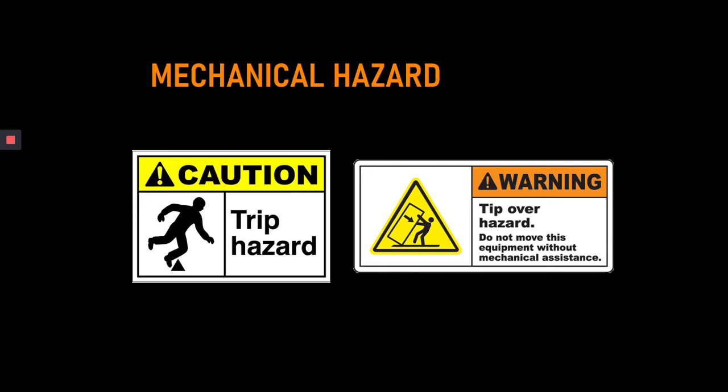Usually mechanical hazards result in accidents inside the laboratory. That's why before you manipulate a certain equipment or move a certain apparatus inside the laboratory, please look for these signs, okay, and read these signs before you do something, before you move that apparatus or that laboratory equipment.